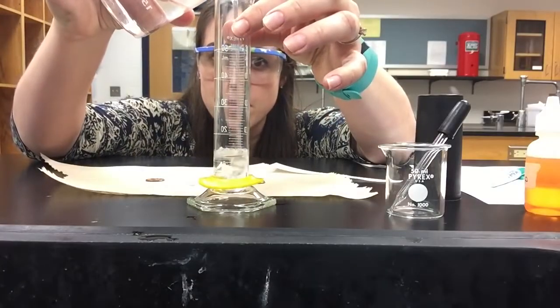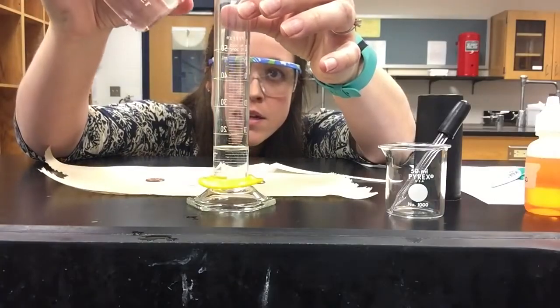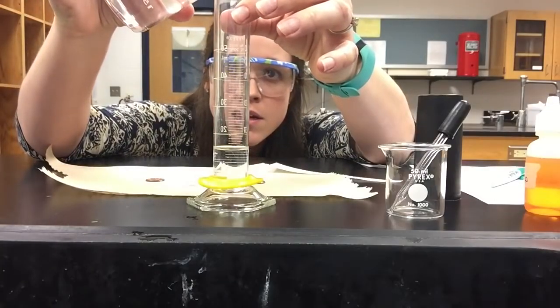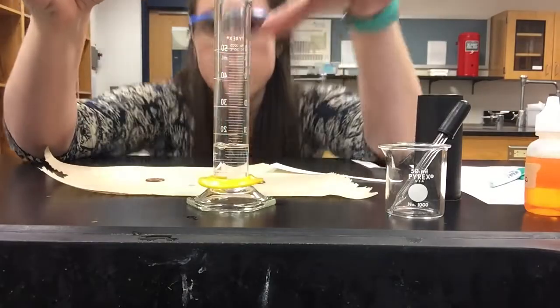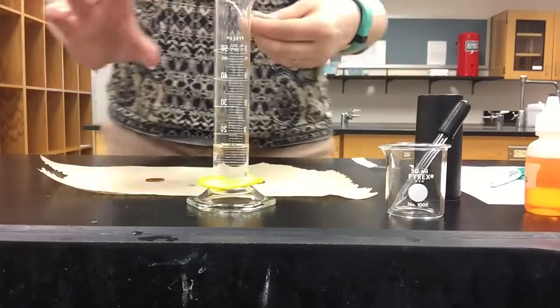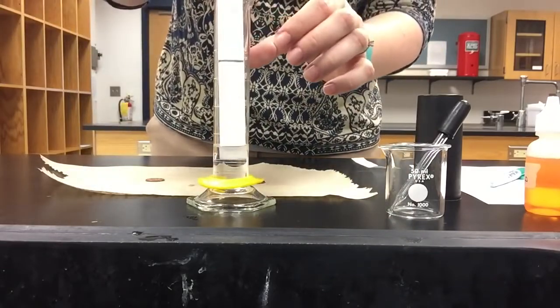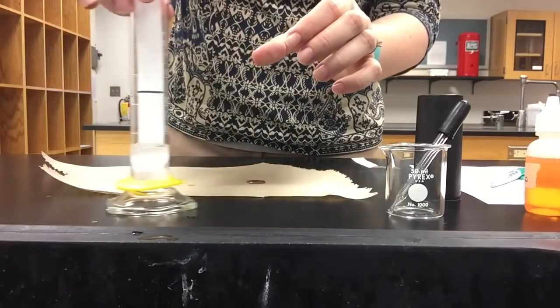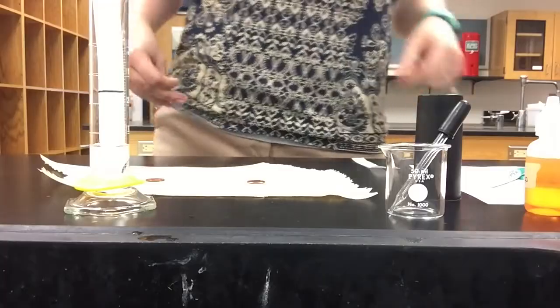Remember, you want to read from the bottom of the meniscus. So we're at 15 milliliters, and we're going to take our green chromatography paper and stick it down into the water. I'll set that to the side so you can watch it for the rest of the lab.